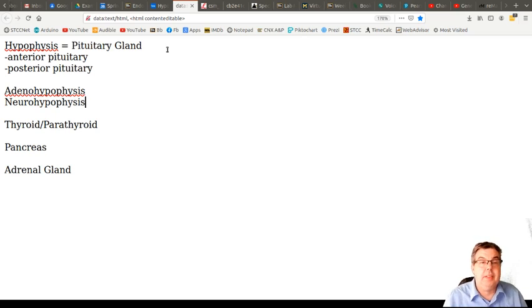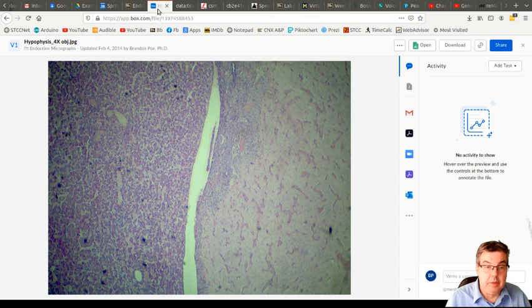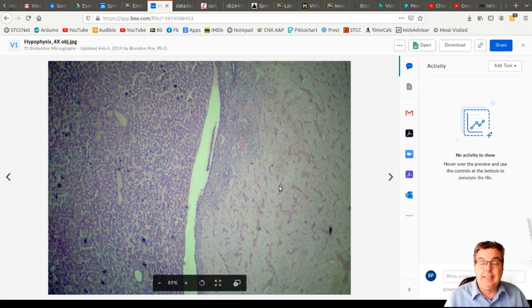And let me just talk about the tissue a little bit to make you understand what's what. So, as I described in the previous figure, what we want to think about here is staining quality, and this is a great place to see that. One side of this picture is darker than the other side. That's all I mean by staining quality, dark versus light, which goes back to what's in the cells that the stain reacts with.